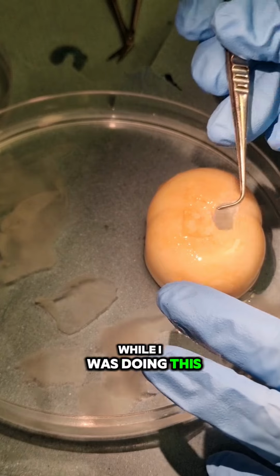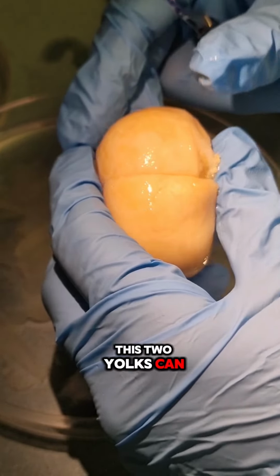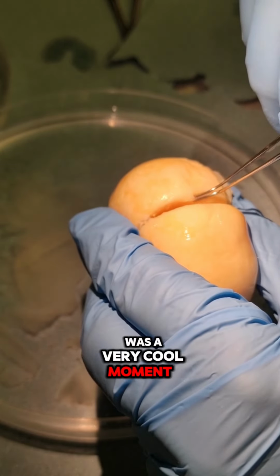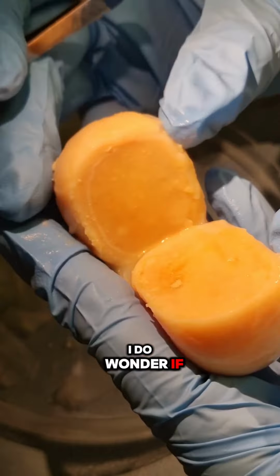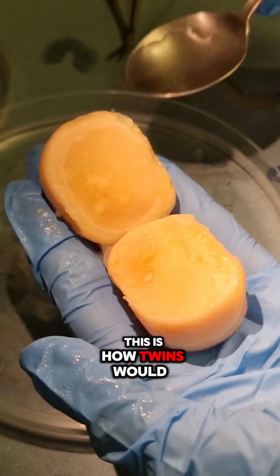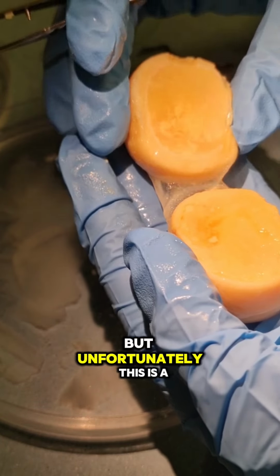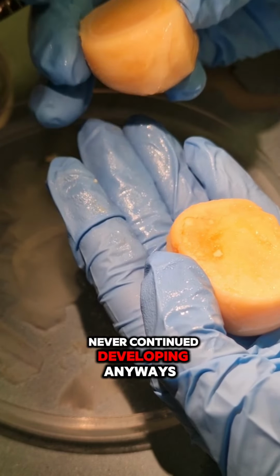While I was doing this, I actually saw that these two yolks can be separated, and I thought this was a very cool moment. I do wonder if this egg was fertilized and it was successful. I do wonder if this is how twins would have developed, but unfortunately this is a failed egg and it would have never continued developing.